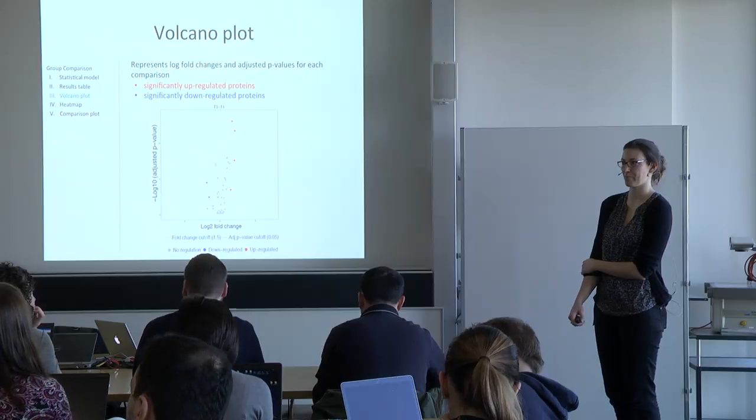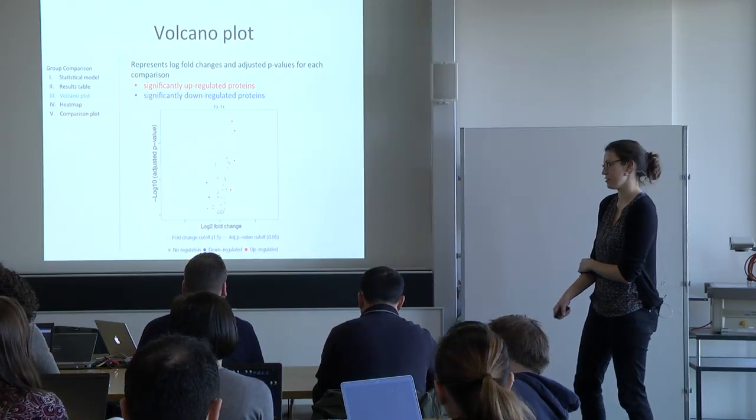Okay. Thank you. Let's go on with the MSstats tutorial.